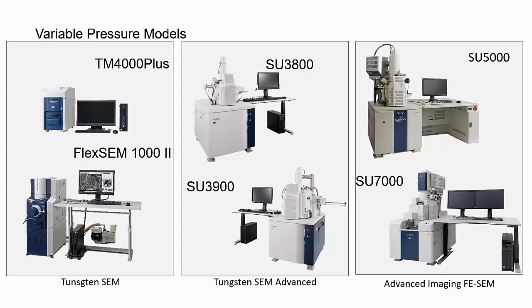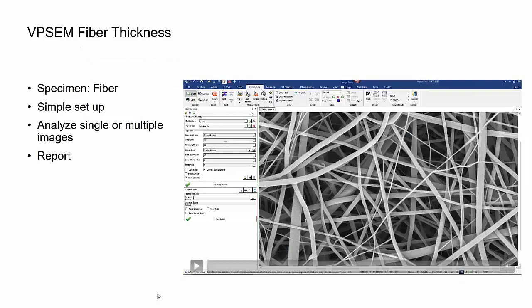And then, of course, for those who actually need nanometer scale imaging, but yet still carry variable pressure type of capability, the SU-5000 and the SU-7000, which can do sub-nanometer or even just a couple nanometer type of imaging resolution compared to the tungsten tool, kind of open up and broadens the application for EBSD, EDS, WDS, CL work, STEM imaging as well, not just secondary or backscatter, but lots of other different kinds of signals. So some of the following examples are going to show how that applies.